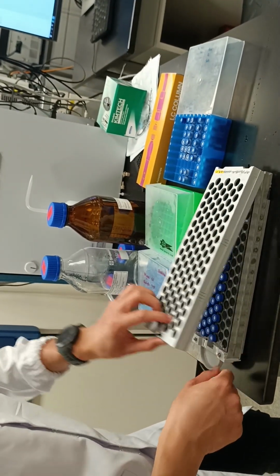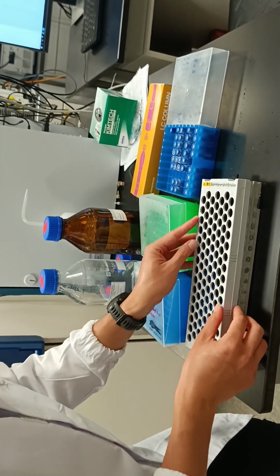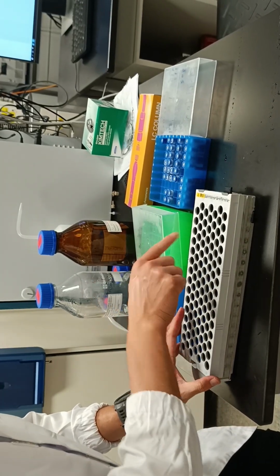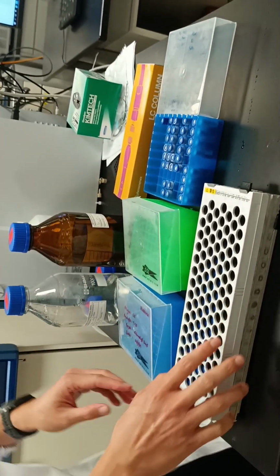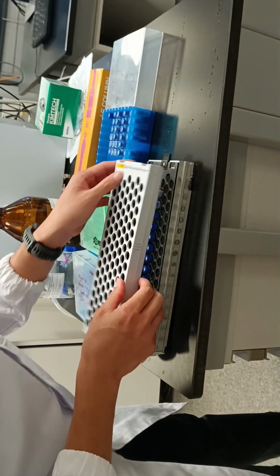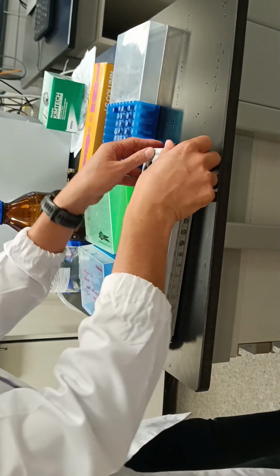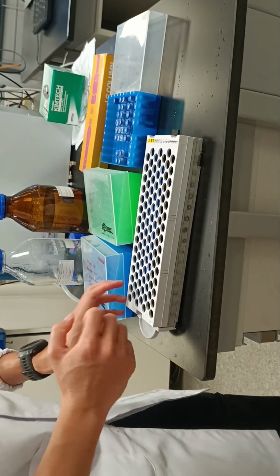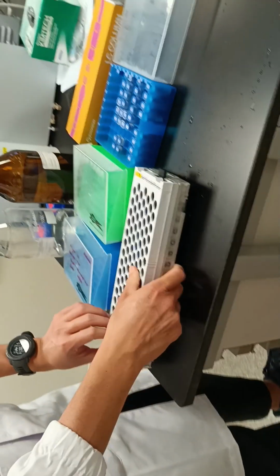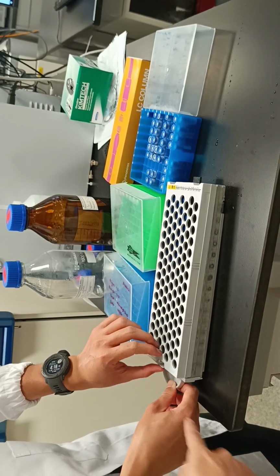Okay, and this one, be careful. Always make sure you cover properly, because there was one incident where a student never closed properly. Then when you put it in the autosampler, the needle actually hit. It was just dented, it never broke, but once it's dented, you can never use it anymore. So what you need to do is, there's this gap here. Just make sure you slot in properly, and once you slot in the front, push it down. You should hear a click sound. This is like a switch.